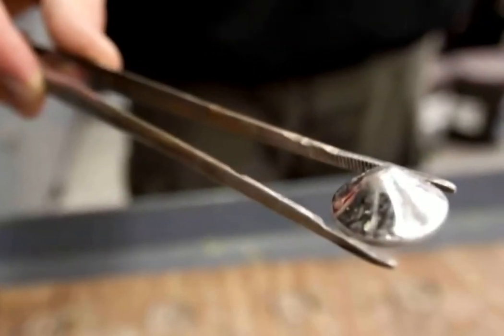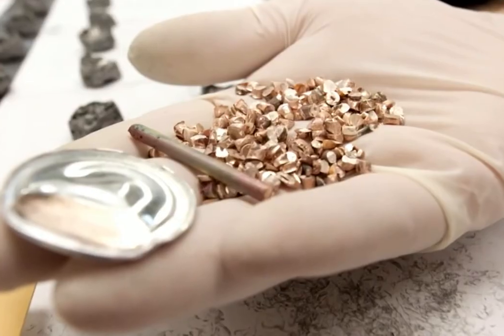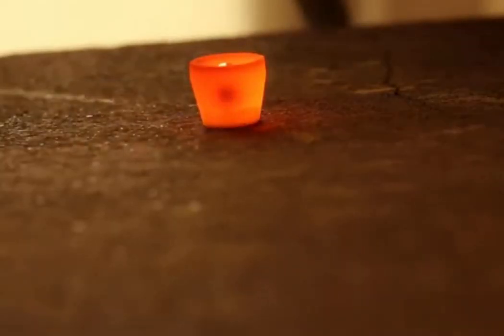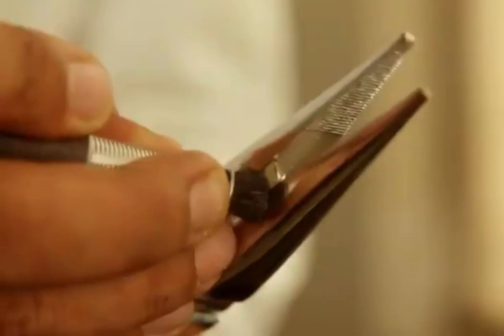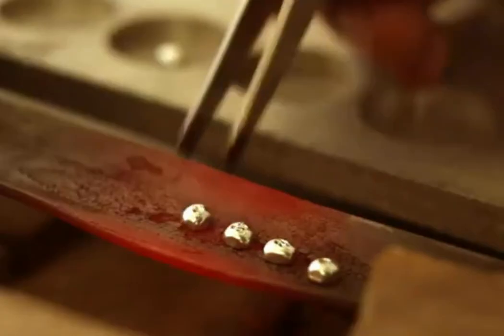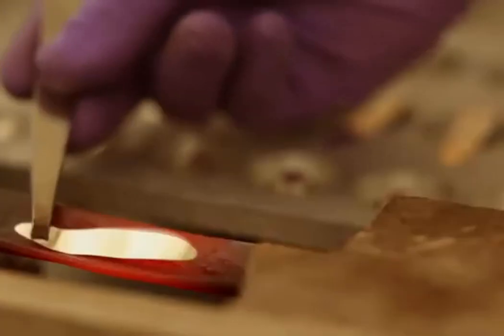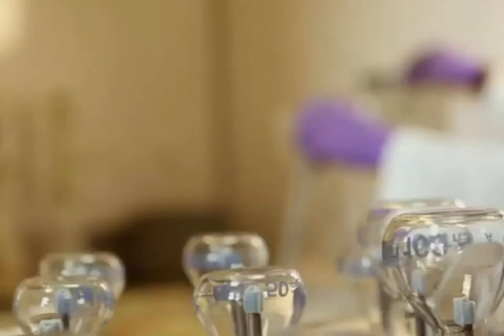This process leaves behind a bead of precious metal known as a prill, containing gold, silver, and PGMs. After cupellation, the precious metal bead — now freed from lead and other impurities — remains in the cupel. To further purify and flatten it, the prill is removed from the cupel and placed on an anvil, where a hammer or mallet is used to carefully flatten it into a thin sheet or foil, exposing and removing any remaining surface impurities.